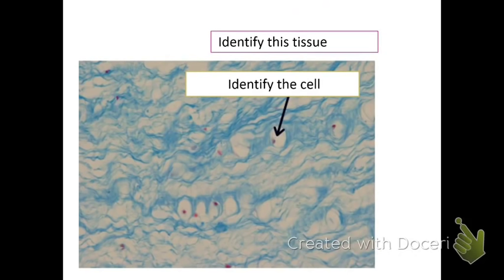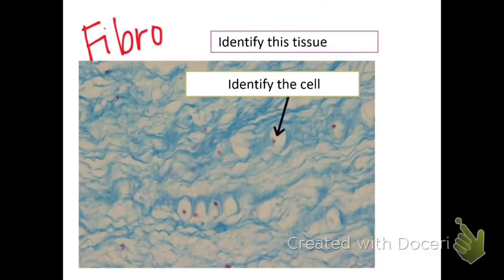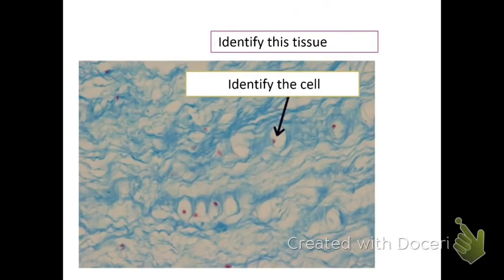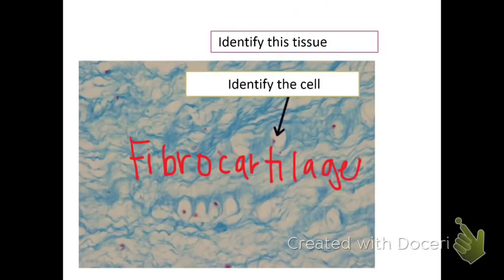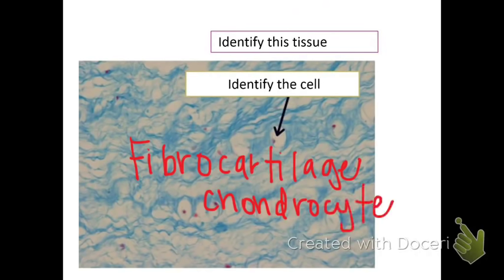Take a second and see if you can figure this one out. This one is fibrocartilage — that's all one word. And one cell is called a chondrocyte.